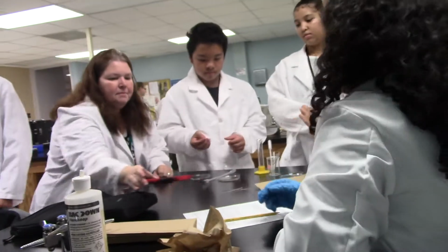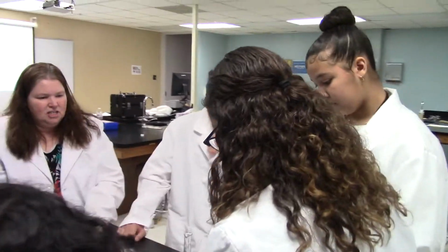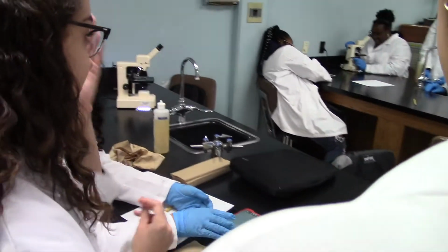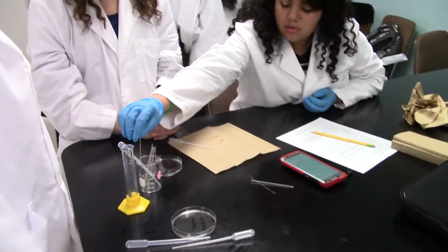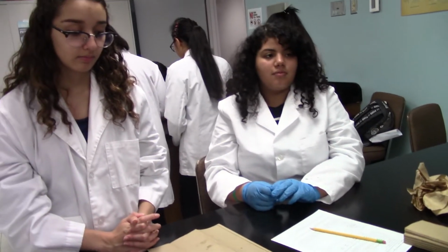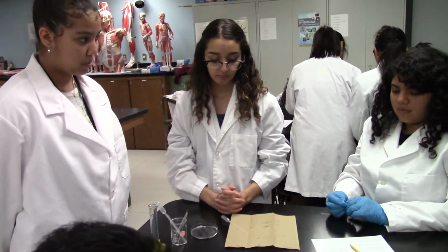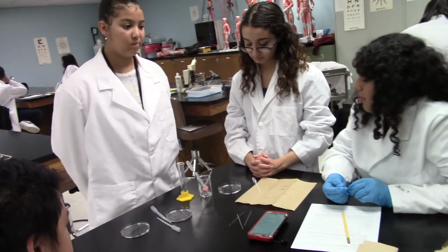Flush him out. Can you do it with your gloves? Yep. 60 seconds in the sugar water. Okay, now. You sound like somebody's grandma. Should we use another one? Yeah. You gotta close one eye. Yeah, that boy is moving like crazy. Are you ready? There you go. You gotta wait until it gets settled.